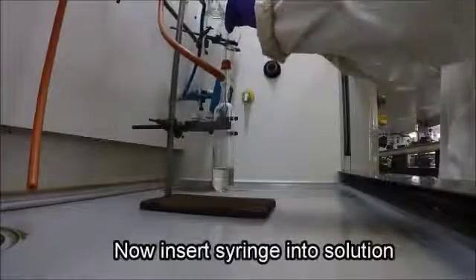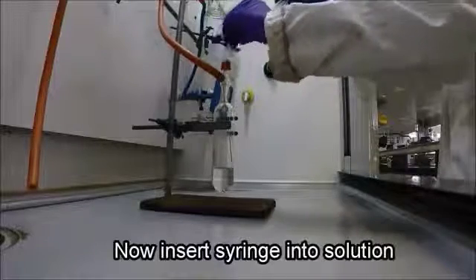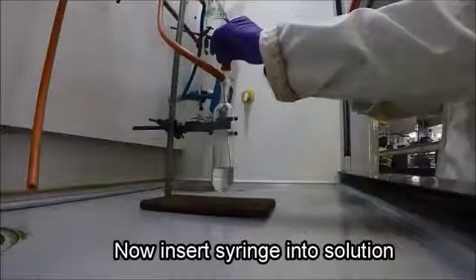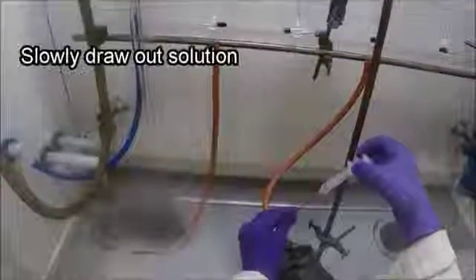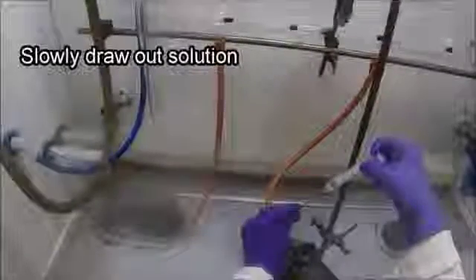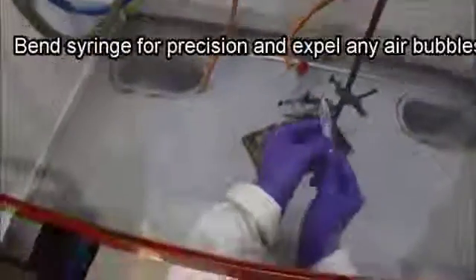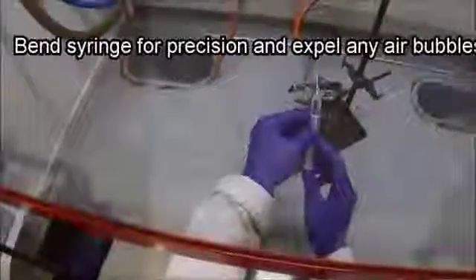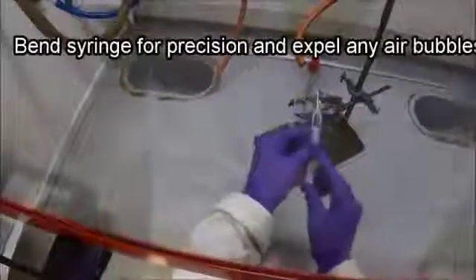Now we can get ready to extract some solution with our syringe. Insert the syringe into the solution. Keep one hand on top of the super seal with the syringe and the other hand to draw back the solution. Typically you want a little more than you need, so try to aim for plus 0.2 or 0.3 ml more than what you need. Now gently bend the needle back as shown and expel any air bubbles back into the flask. Ensure you have measured the correct amount of liquid. I hope this video has helped you learn a little more about how to use a Schlenk line.